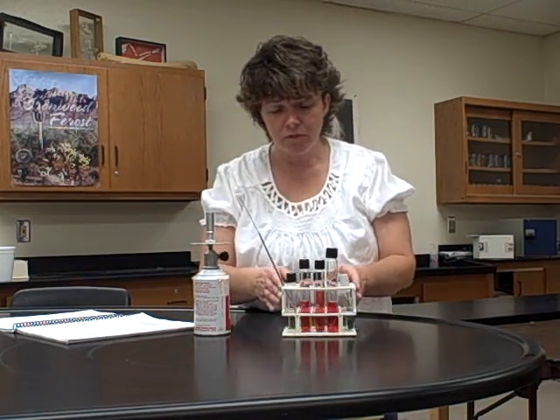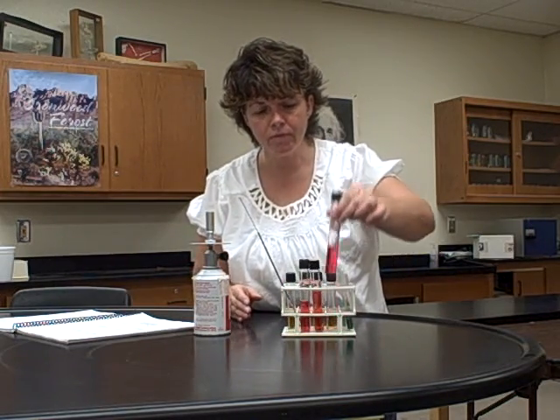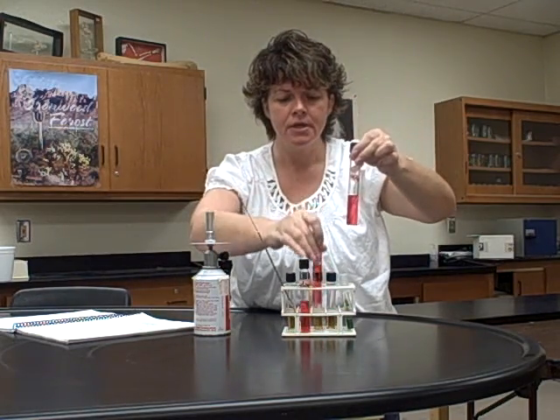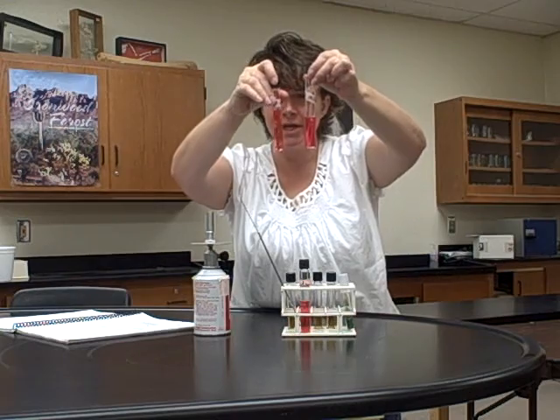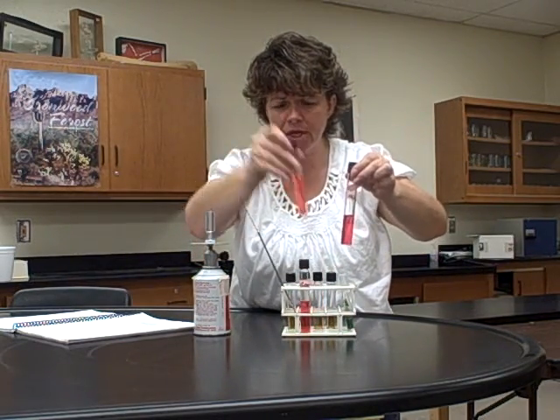All right, the first one that we're going to do is the fermentation tubes. What I want you to notice is these fermentation tubes. You might see bigger or smaller ones, and they're going to be a shade of red. I like for them to be red, but sometimes they end up a little on the orangey side or the peach side.